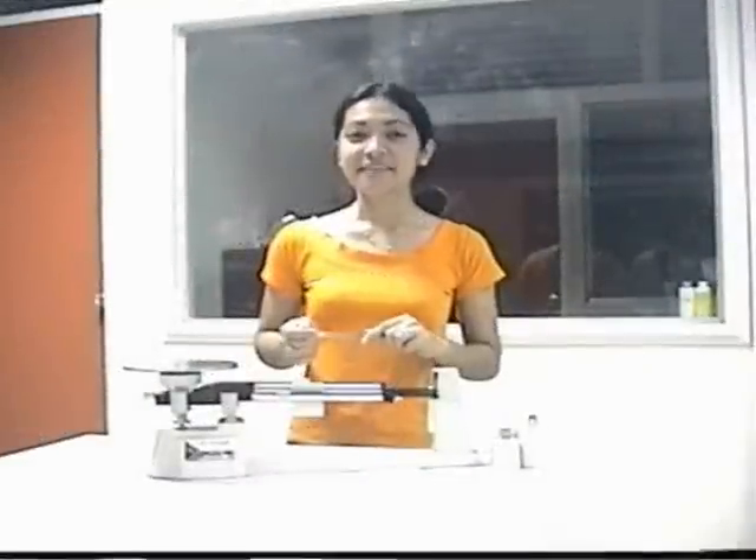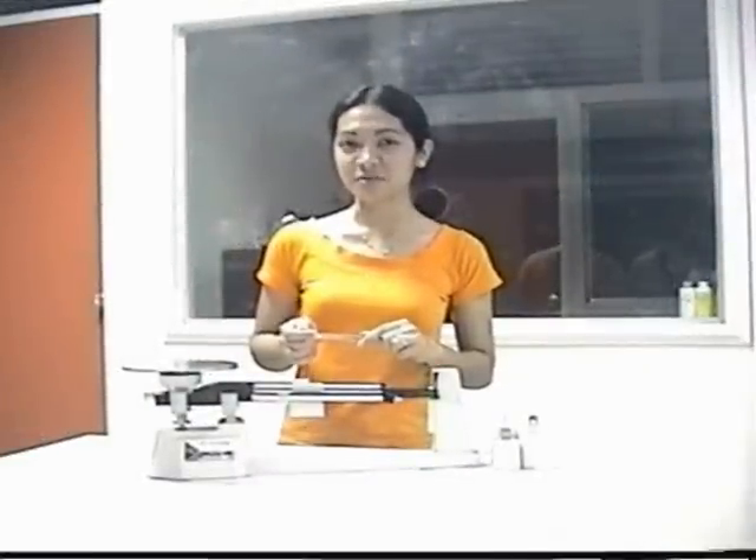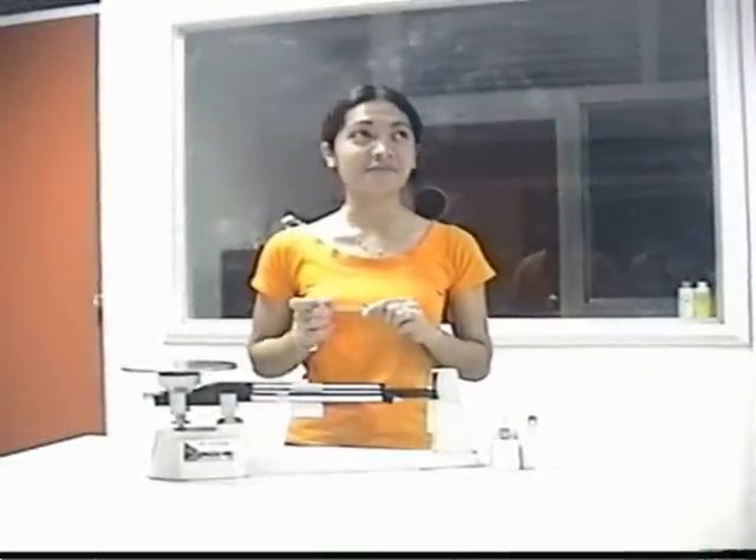Have a nice day to all. Today, I'm going to present to you one of the apparatuses of the Science Laboratory: the Triple Beam Balance.